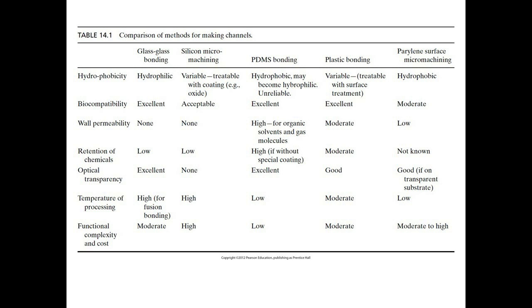If it is for in vitro application, maybe it's okay. Another concept you have to see is hydrophilicity or hydrophobicity. If you are dealing with a solvent like water, sometimes you need it to be hydrophilic.